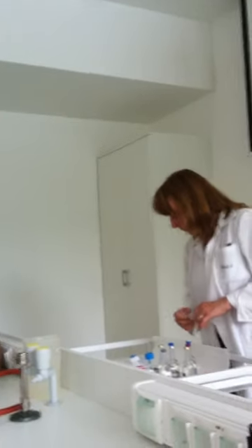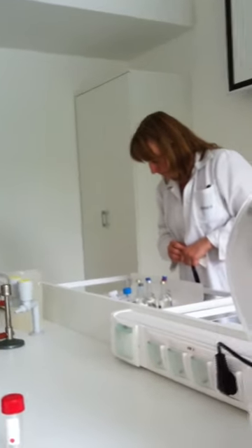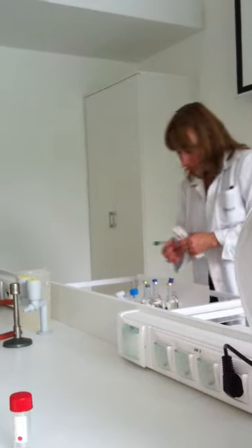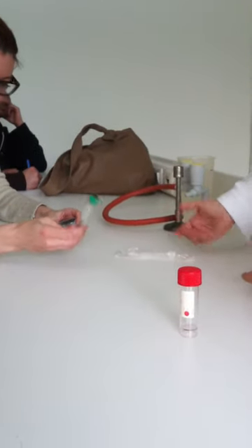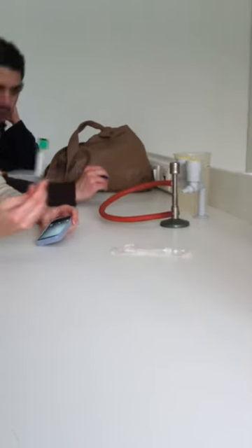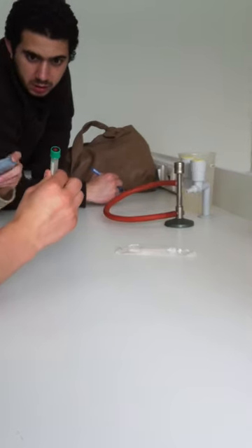puncture or into a sterile tube, which could be, for example, this one. So also very important that you should close it, or this one. So any could be suitable if sterile.